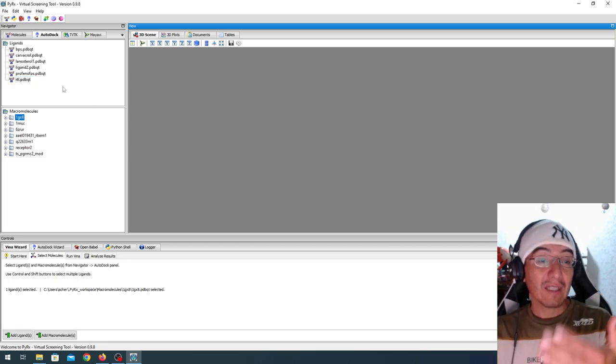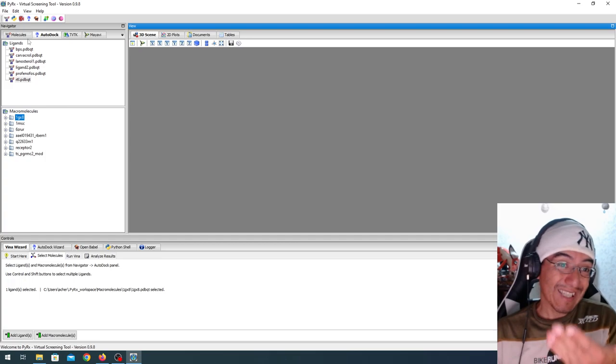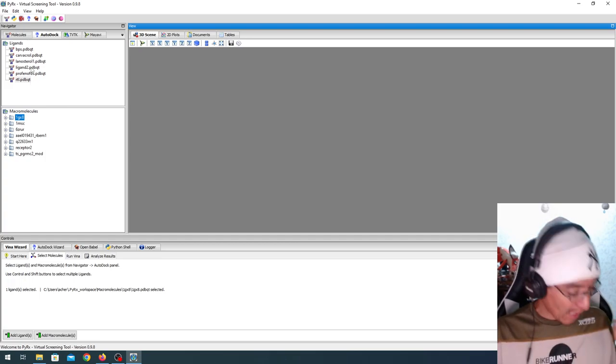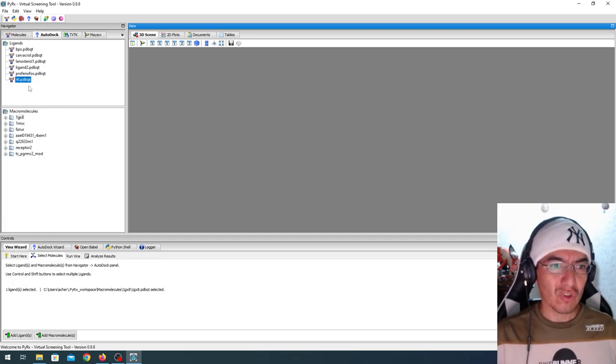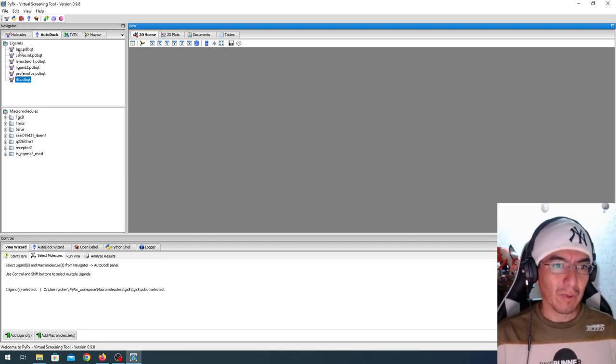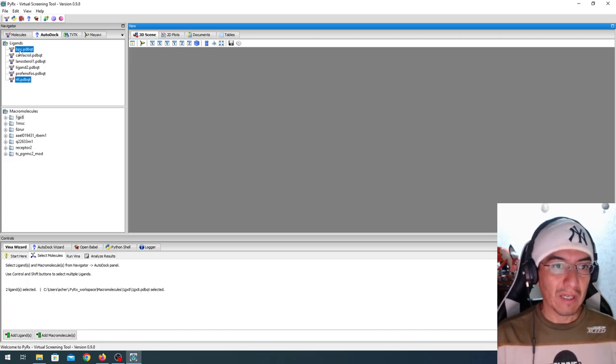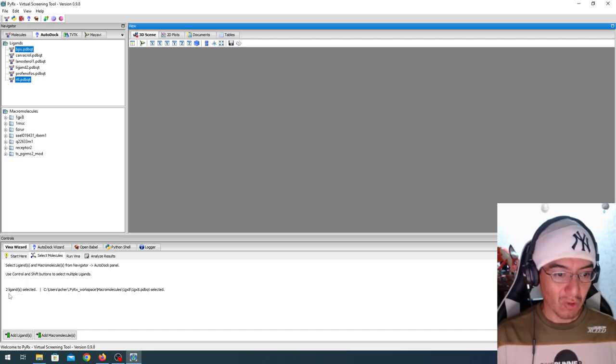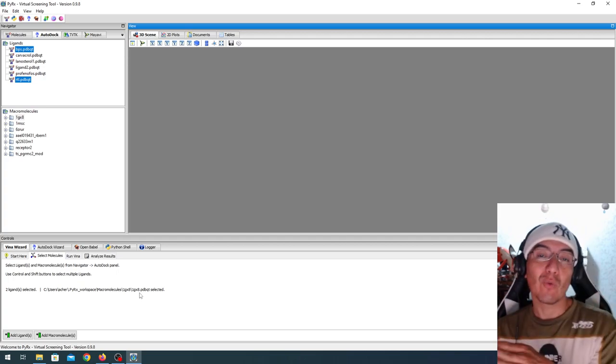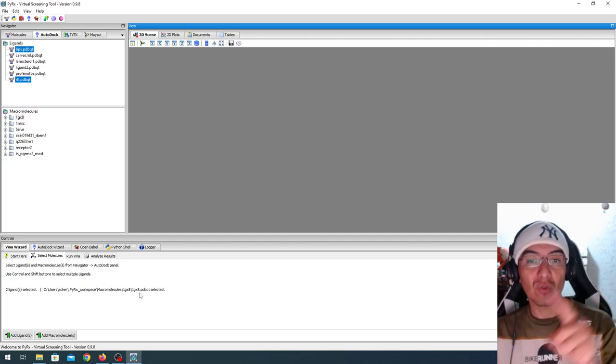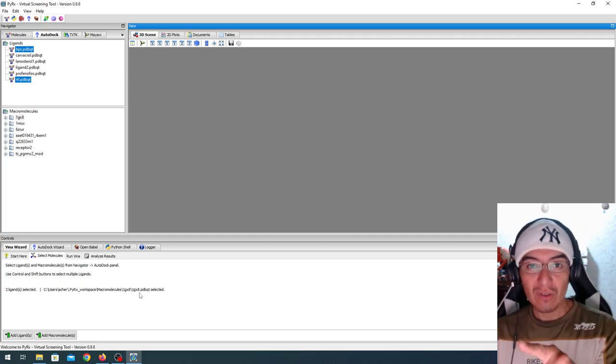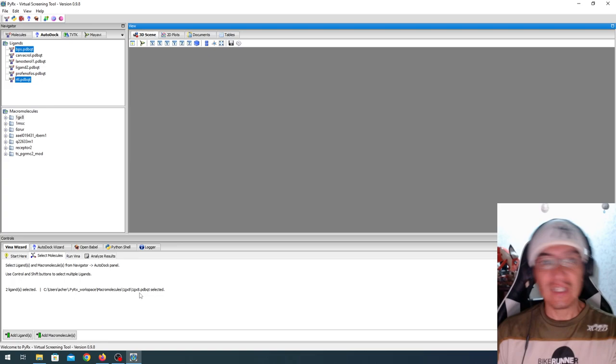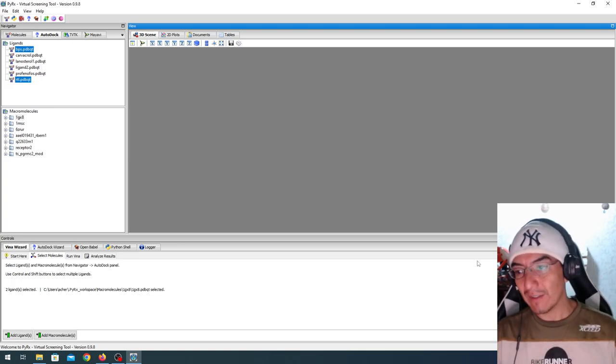We could have selected, or we could still select several ligands and run the docking, and I'm going to do just that in this example. Clicking CTRL on my keyboard, I also selected BPS, so we have two ligands selected and one receptor, and what PyRx is going to do is run the docking for BPS first, and then for RTL. So click on forward.